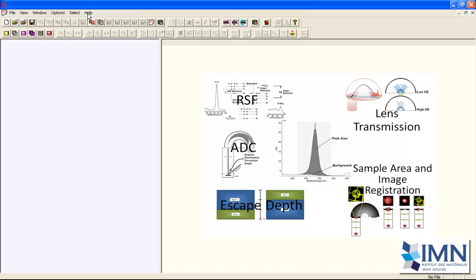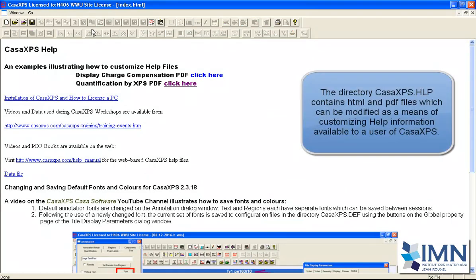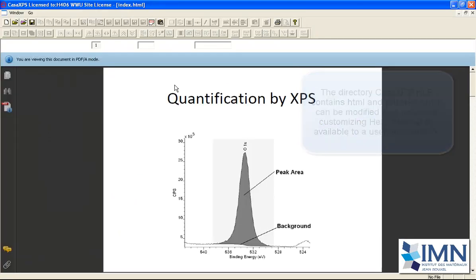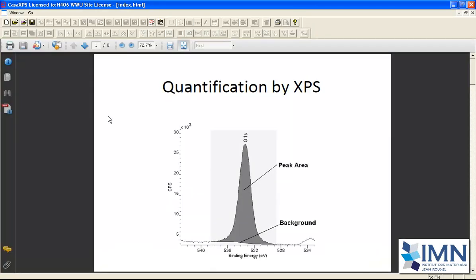XPS is a quantifiable technique in the sense that electrons leaving the sample have a probability of arriving at the detector and being recorded. The relationship between the electrons arriving at the detector and the electrons leaving the sample are a measure of the amount of substance.